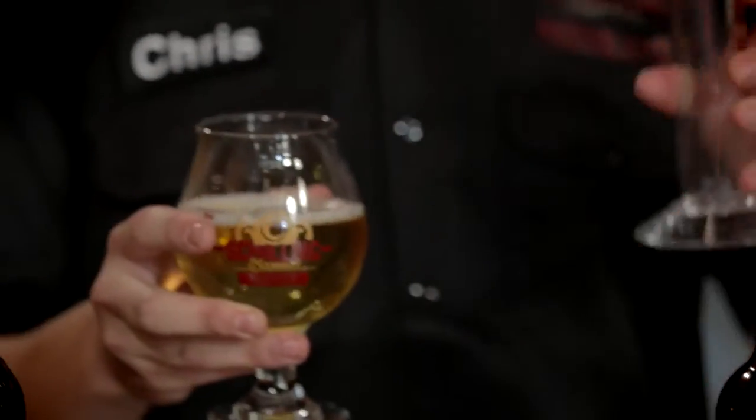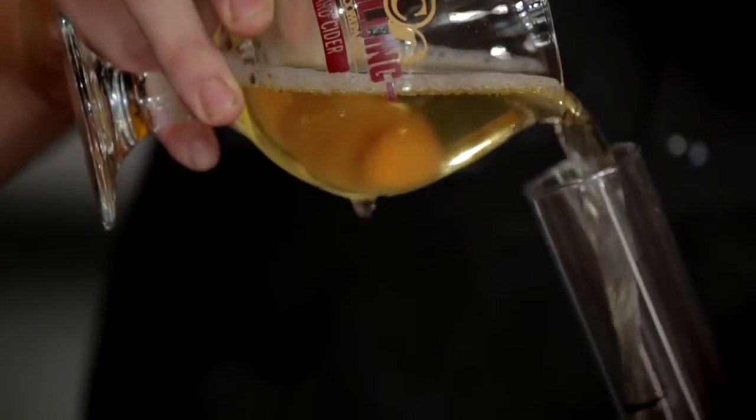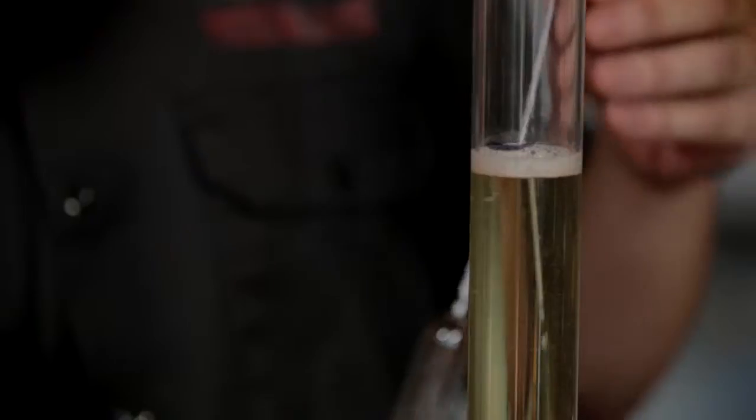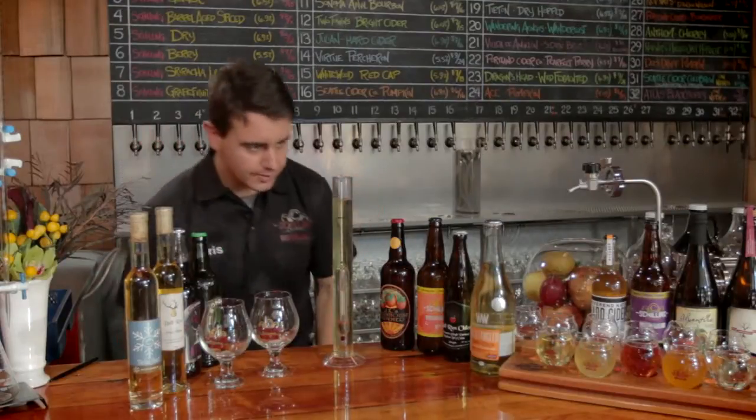Now that we have our sample, we want the bubbles to clear out a little bit so that we can get a good, honest reading of exactly where the level of the liquid is. As it sits, it will acclimate to the right temperature and float to just where we want it to.